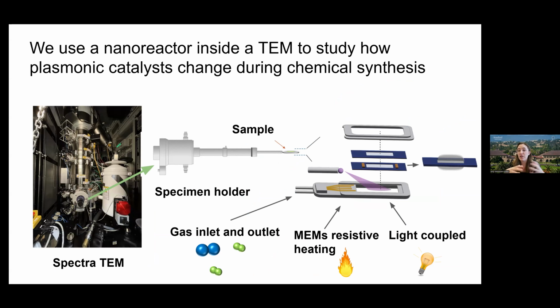Enter TEM. We use a nanoreactor inside of a TEM through a custom-built holder that allows us to flow gas mixtures in and out with different flow rates at near atmospheric pressures. We can actually go slightly above atmosphere. We can reach temperatures upwards of 1,000 degrees Celsius, and using fiber optic cable, we can couple in light and shine light on our sample, so pretty much do photocatalysis in the TEM.